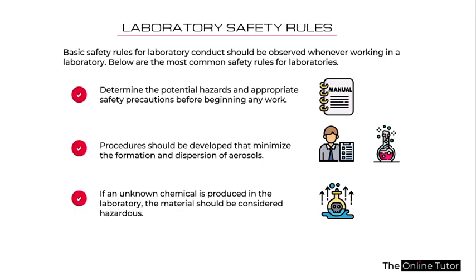If an unknown chemical is produced in the laboratory, it must be considered as hazardous. So don't assume any material that you produce in the lab is going to be less hazardous or is neutral, and then you want to maybe taste it or something like that. Don't do that. So assume all the products that you form in the laboratory are hazardous and they can cause harm to you. So you don't go trying to sniff it, trying to ingest it, or trying to lick it or anything like that. Assume that they are dangerous for you and then treat them as such.